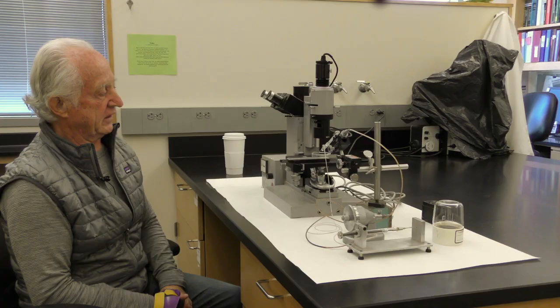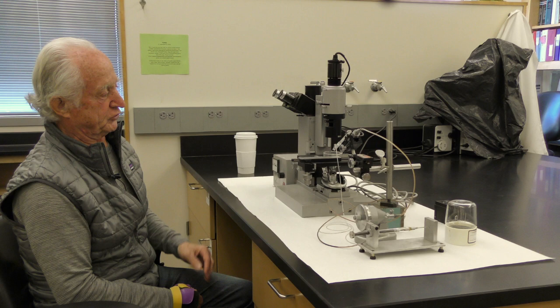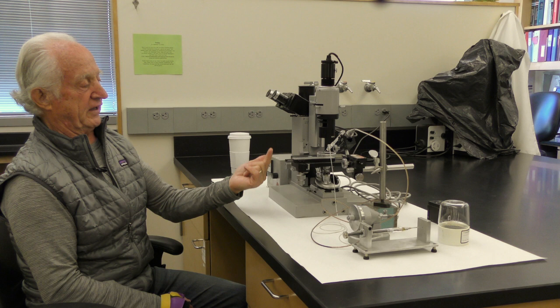The microscope is what we call an inverted microscope. It's actually looking at the image from bottom up. The reason for that is that we want to be able to work up above but see from below.